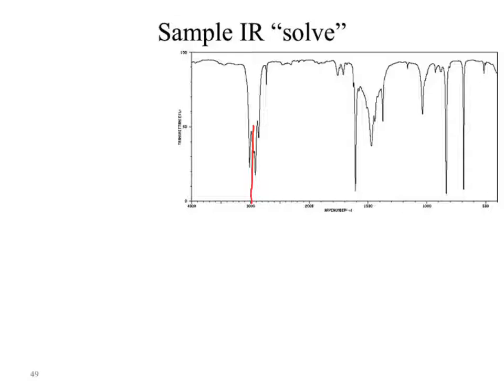What do I have in that one signal? CH SP2 and CH SP3. Both signals are present. Does that overall look that much different than just a CH SP3? No. That line on 3,000 is a hard line. Find it, use it.